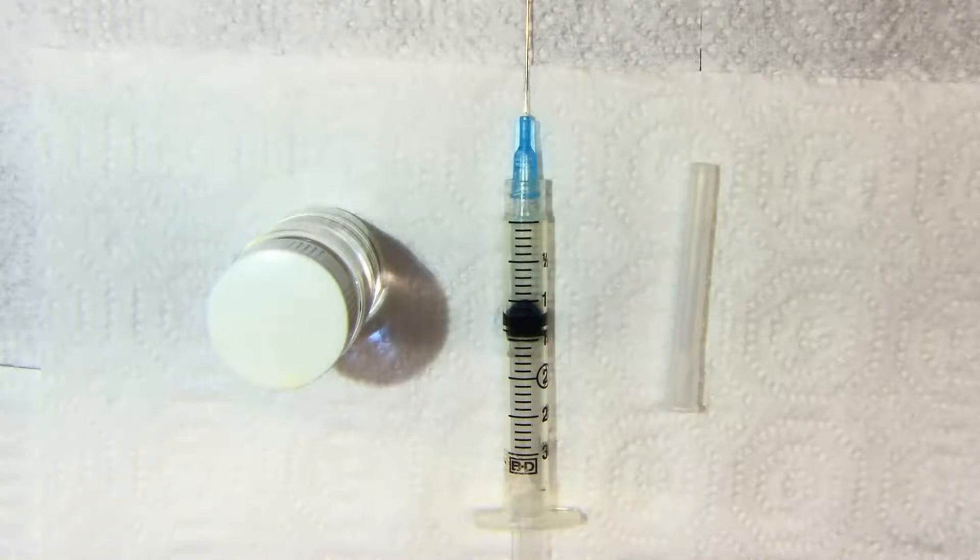Now, some syringes, like this one, have a stopper on the plunger. That's the black thing that you see here. You will read the syringe at the circumference of the stopper closest to the needle. The dome is ignored.